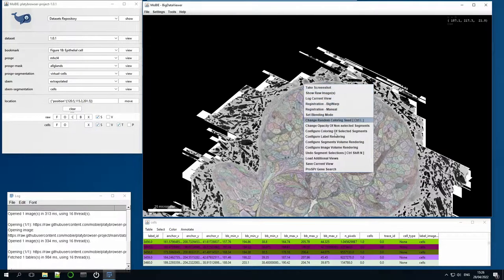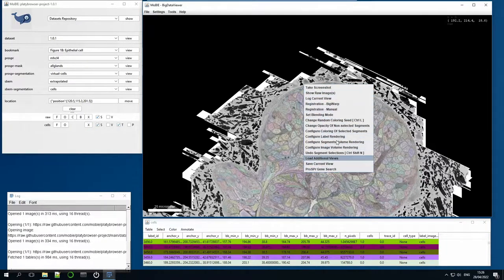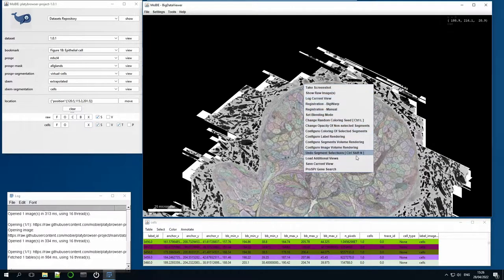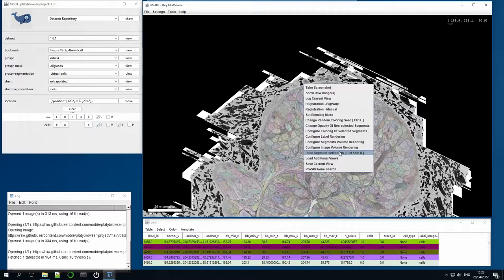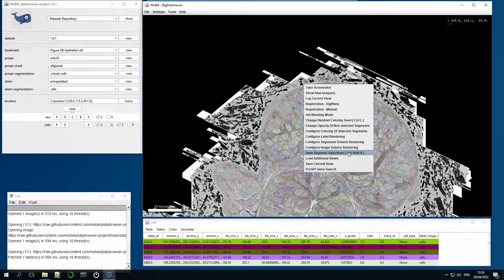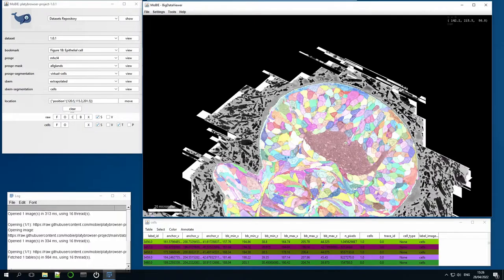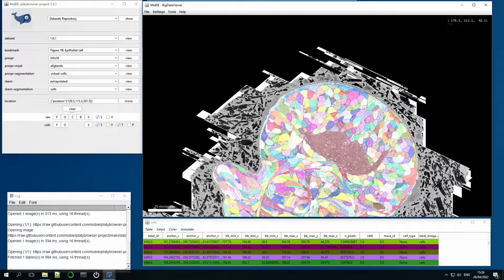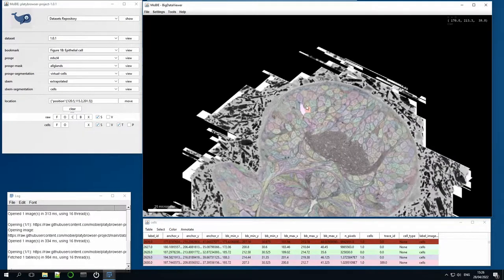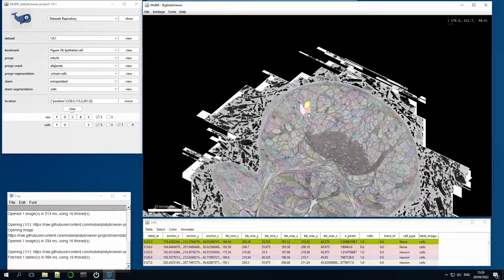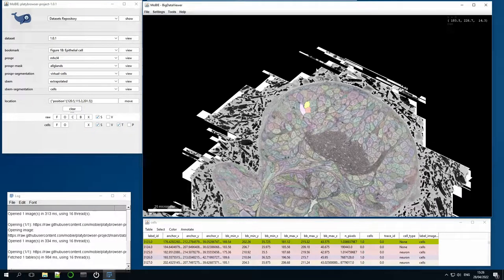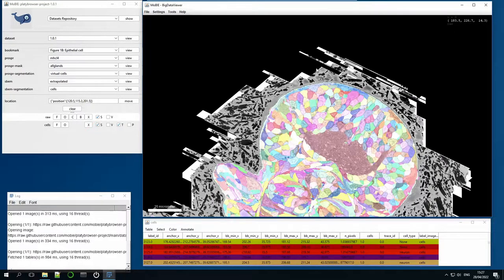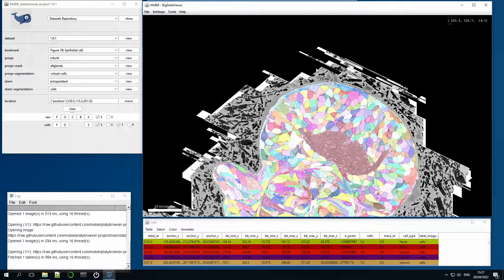So if I now want to deselect that, I can right-click and open this menu. It has lots of different options, like taking screenshots and various other things. The one that we want is this undo segment selections, and in brackets there it has the keyboard shortcut for the same thing. When I click it, everything becomes deselected and colorful again. So just to show the keyboard shortcut, if I click those cells again and now Ctrl-Shift-N, you'll see the same effect. And I'll use that a few times later on in the video.